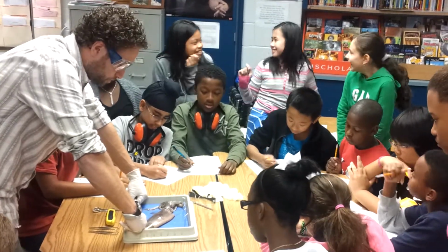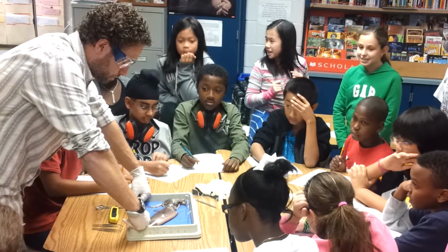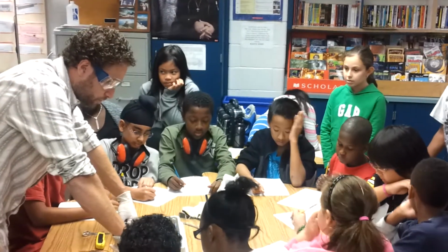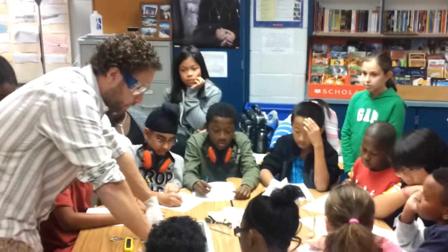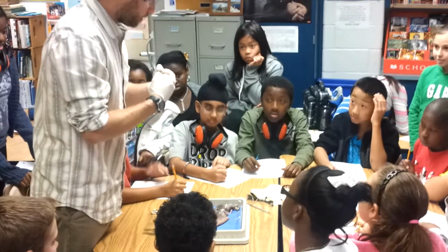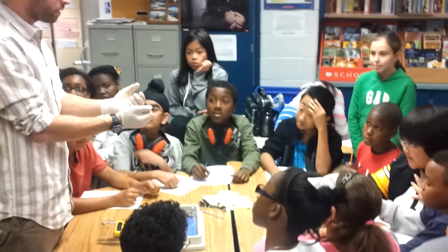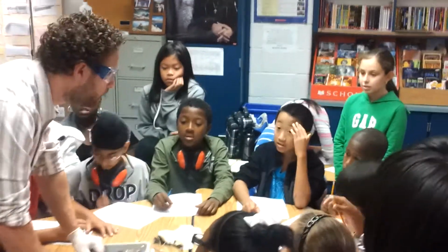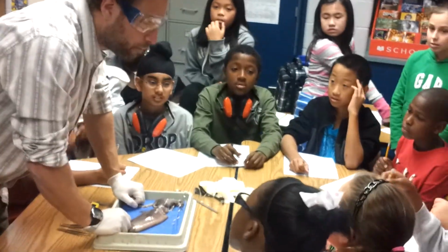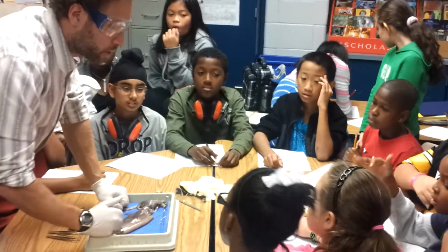Cover up your clothes. You could use this with a lab coat or a smock. It doesn't matter as long as no one cares if you get squid guts all over you. I went over to Mr. Lee's science room today, and he was too busy to give me a cover. We can just splash it on you.